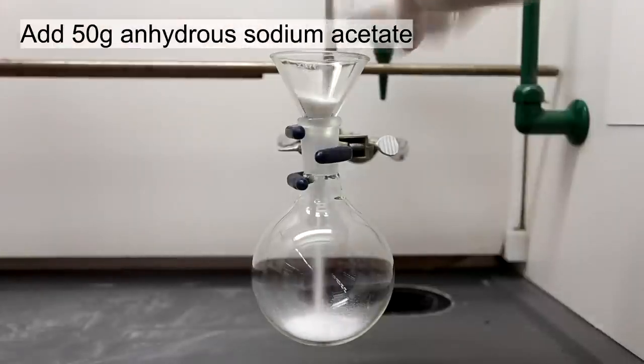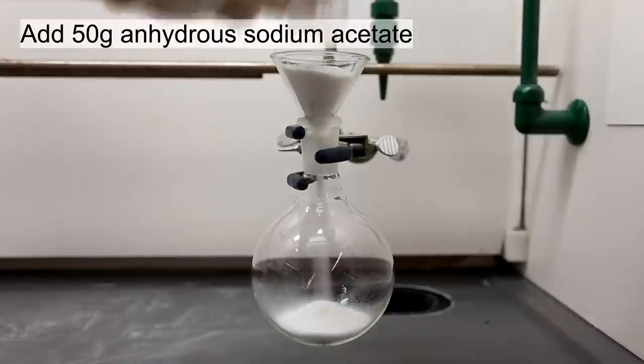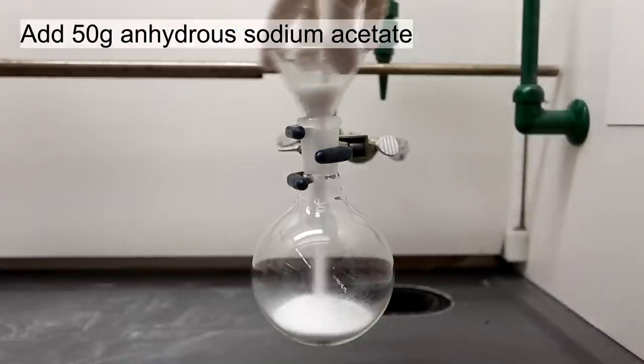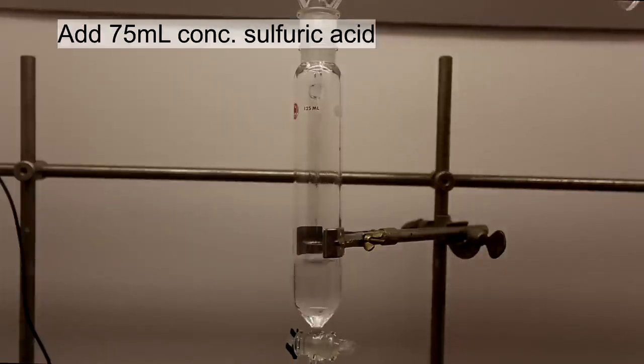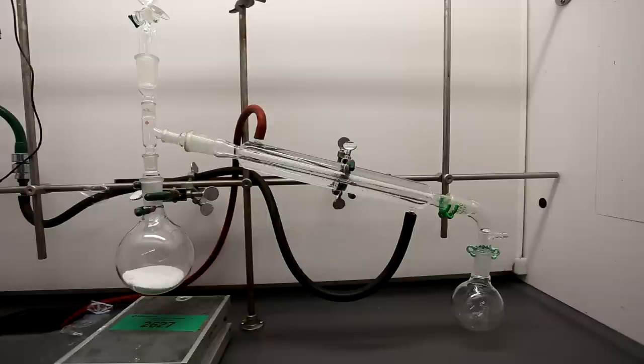First, a round bottom flask was charged with 50 grams of anhydrous sodium acetate. Next, to an addition funnel, 75 milliliters of concentrated sulfuric acid was added. Before the addition, this is what the entire apparatus looked like.